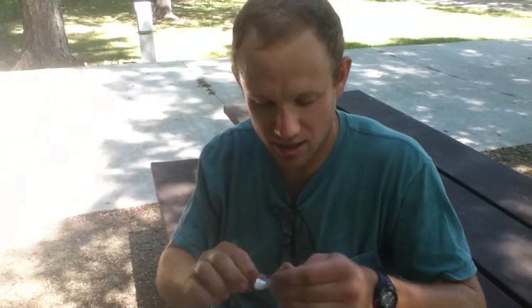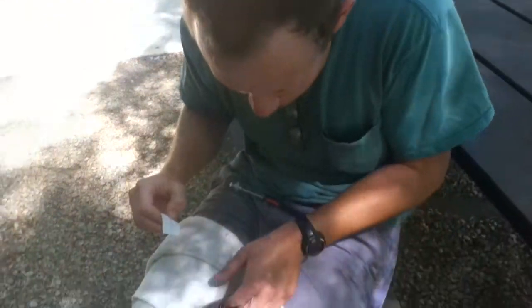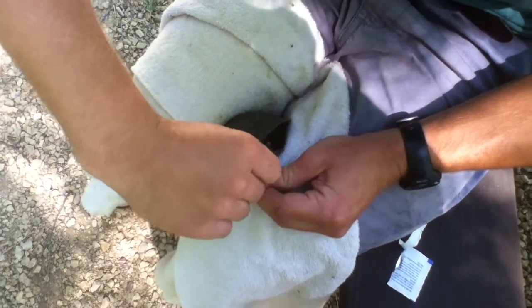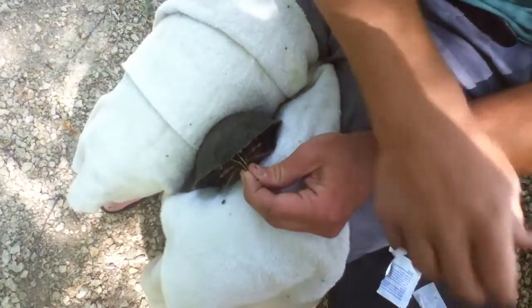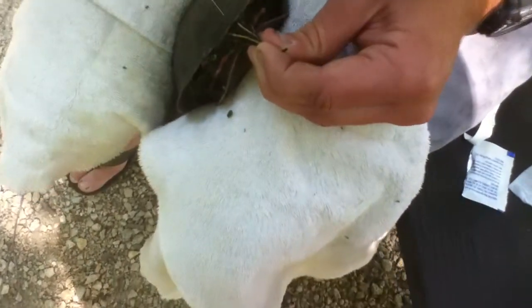First thing we're going to do is clean the area with a swab that we're going to draw the blood from. We'll pull her tail out and clean it off, and now I'll try and get this blood sample.